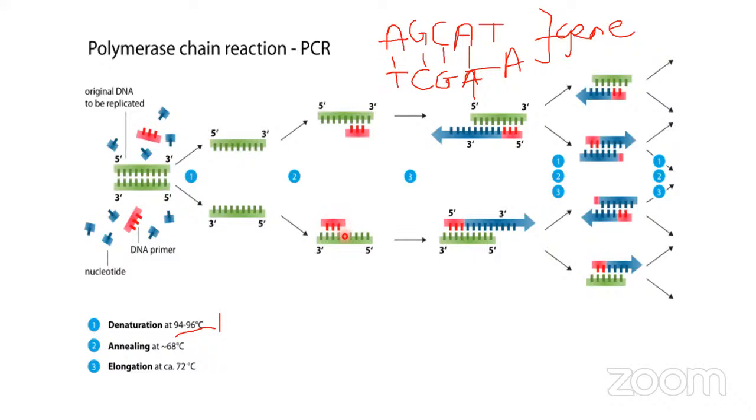So when it binds, we still have some blocks, sequences that have not been fixed. The nucleotides that we've already added into this reaction will now come and fix them. If this is an A here, this will be a T. This is a C and a G. They will all bind and fill this up and become separated. So you now see this is the primer which started the reaction. This is the nucleotide which completed the reaction and continued to extend. So this is the denaturing, this stage is the annealing, and this is the elongation.